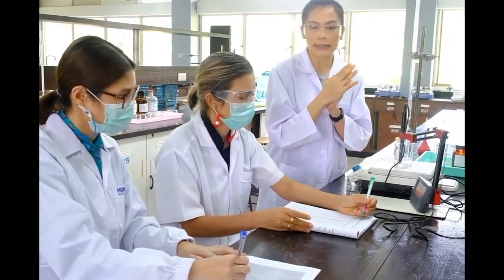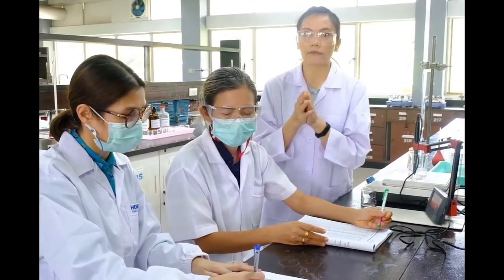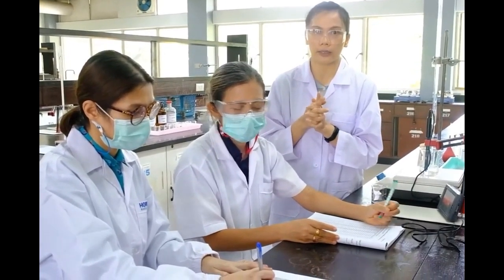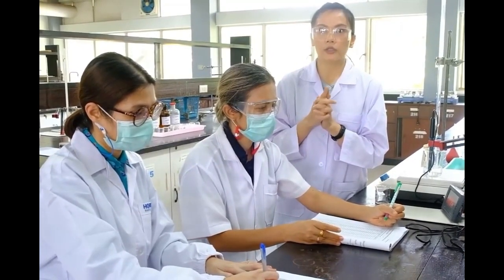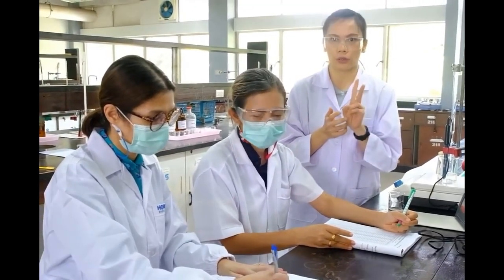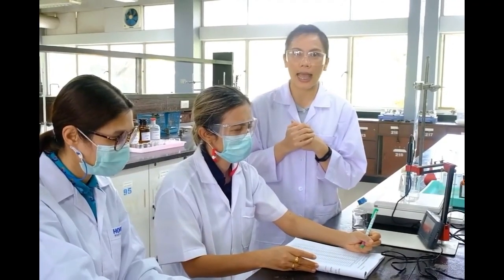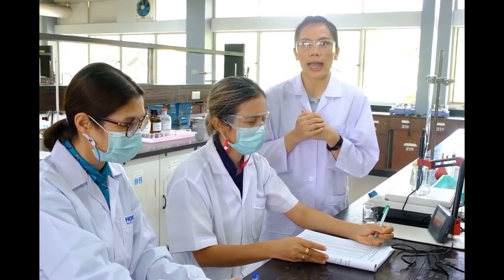The student will obtain a graph which is called a titration curve. This titration curve will be used to find the equivalence points. Since maleic acid is a diprotic acid, students will obtain 2 equivalence points. The volume at these equivalence points will be used to calculate the pKa of maleic acid. Therefore, 2 pKa values will be obtained.